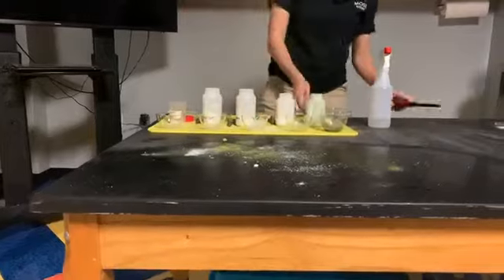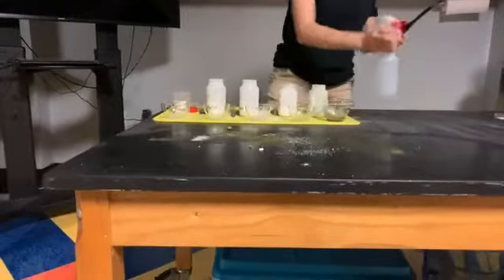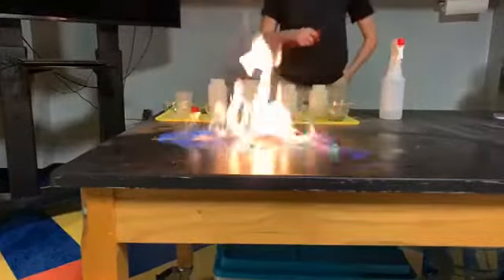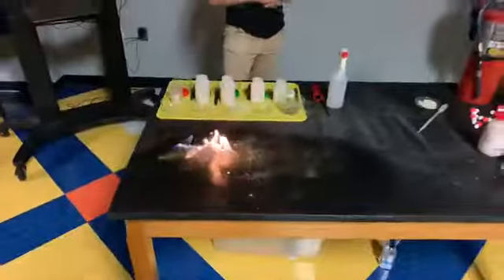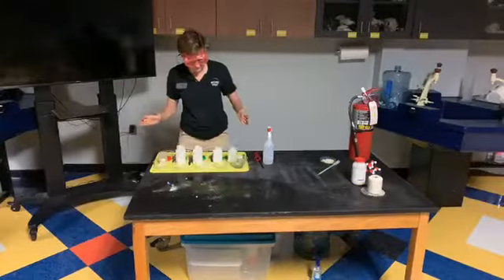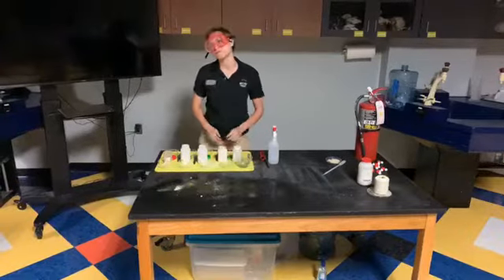Too, what your favorite color that you've seen that we've done today was. I'm very partial to the green flame myself, but the pink is also very nice. And it's kind of like fireworks right on our table. Remember, please do not try these experiments at home. They are quite dangerous, and you probably don't have the materials to do it, at least in the case of these salts. So, be careful out there.